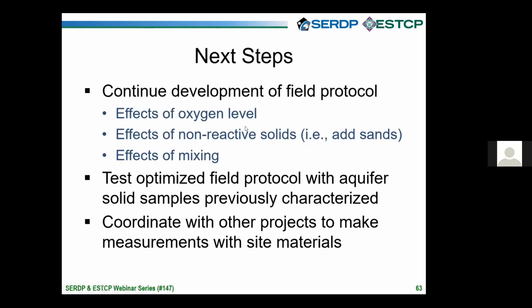In terms of the next step, we're going to continue developing our field protocol, looking at different operational variables that we can potentially encounter in the field, such as the oxygen level. Also, we're interested in looking at the effects of non-reactive solids. Typical aquifer solids only have a few percent of the reactive phases. The majority of the mineral phase might not be that reactive. We want to see how those fractions will impact the ORP measurements. Finally, we also want to look at the effects of mixing on the ORP measurements.